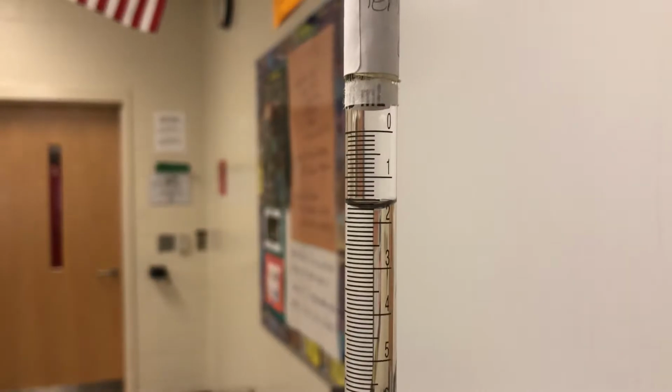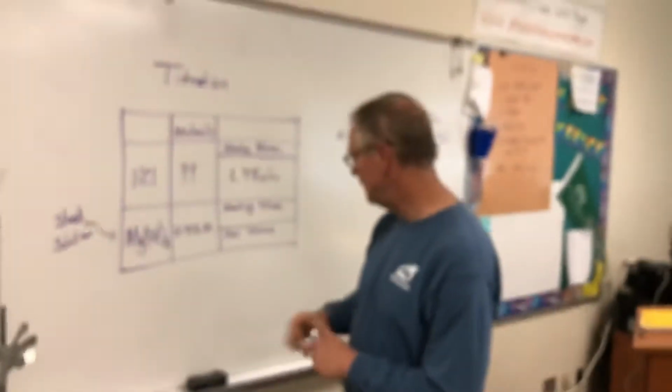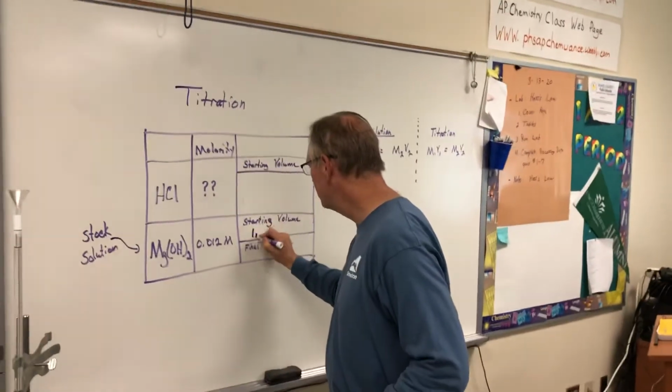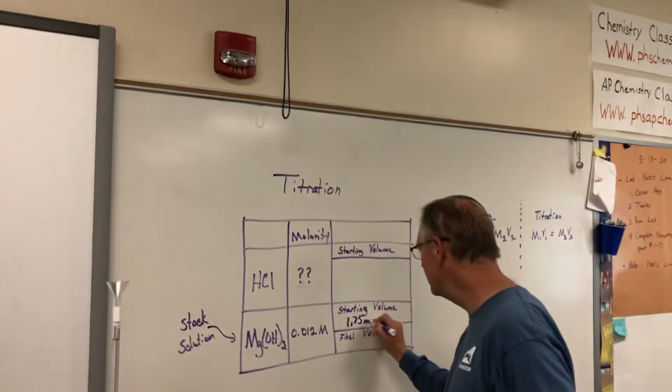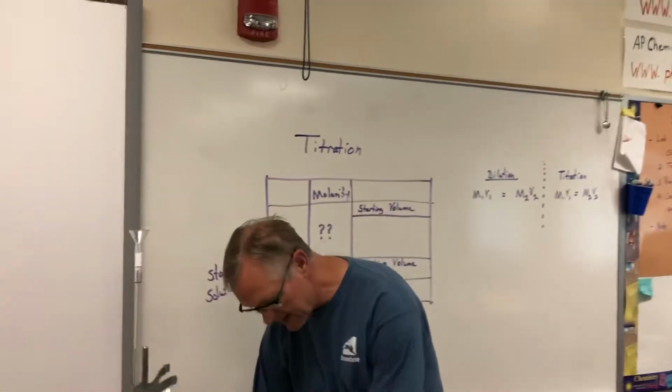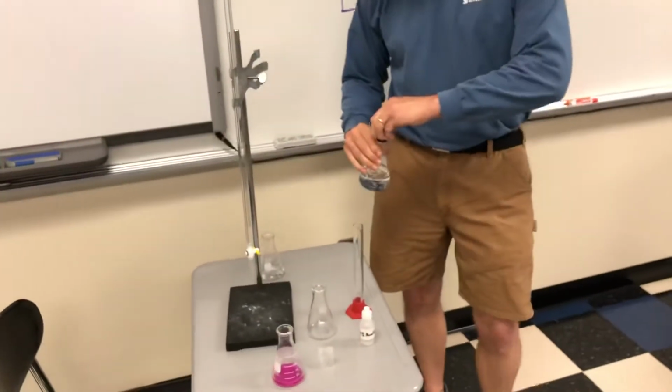I put it in the wrong spot. Let me come back over here. 1.75 milliliters.